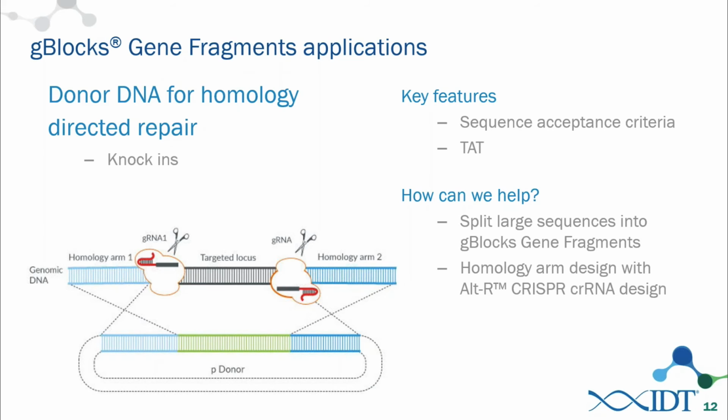And the answer to that is yes. We're working on that. We're working to relax the rules, particularly at the extremes of the GC content. Right now, our rule cutoff is 68%. So I can see why these are not a great option for him in an organism that has a 70% GC overall. We're going to relax that.